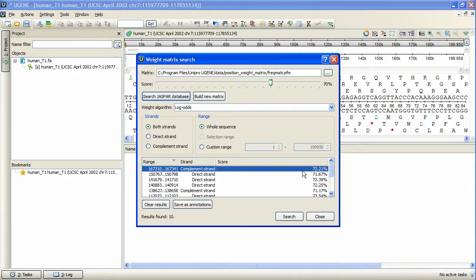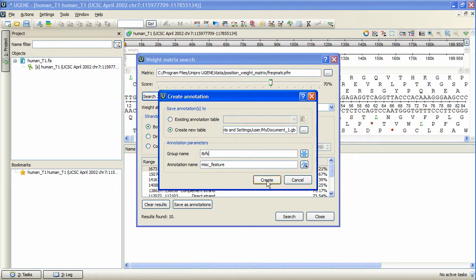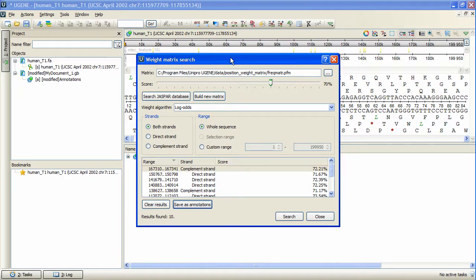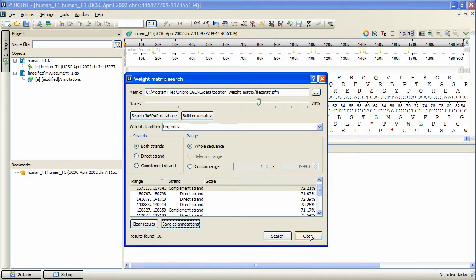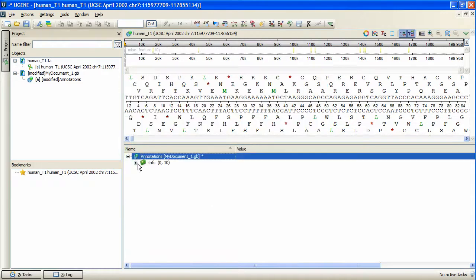Search results can be saved as annotations, which would contain matrix properties if a JASPAR or Uniprobe matrix was used. Let's save the annotations. As we can see, the saved annotations have been automatically added to the opened sequence view, and we can close the dialog and browse the results.